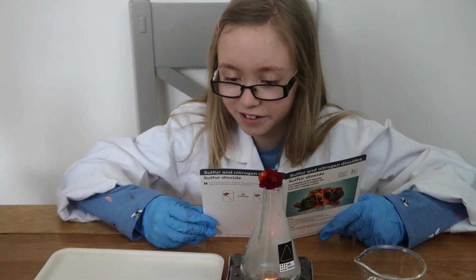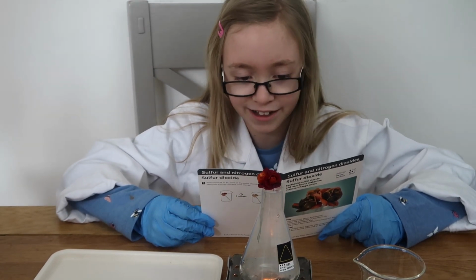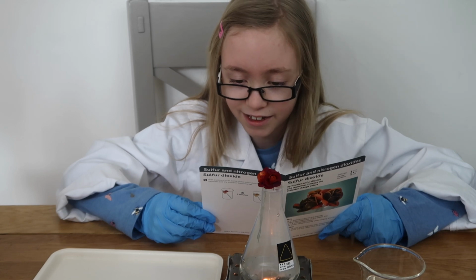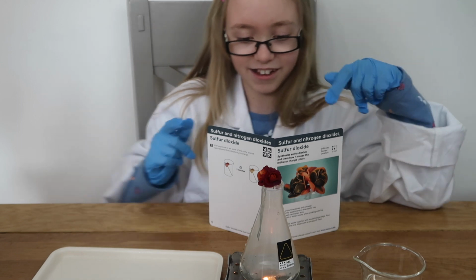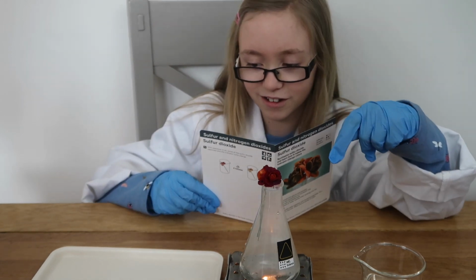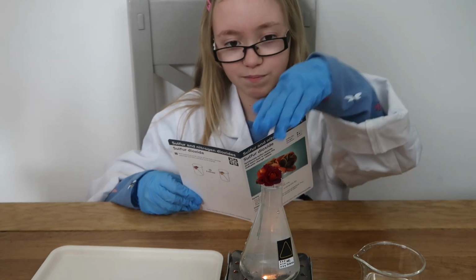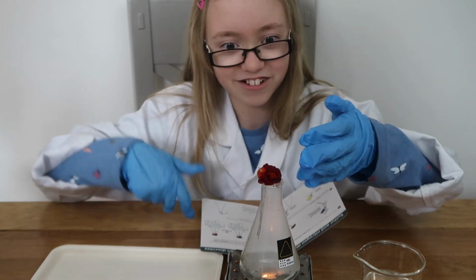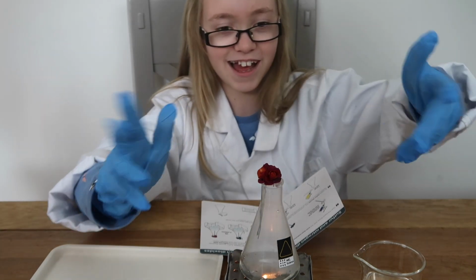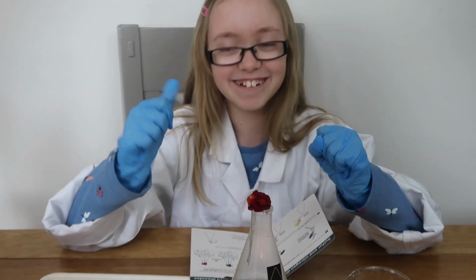It says that the reaction speeds up when heated. Sulfur dioxide dissolves in the water imbued in the flower, forming sulfurous acid. The acid-base indicator reacts to this and changes colours. So what we're seeing happening is the sulfur dioxide dissolves at the bottom, and the water is imbued into the flower by bringing it up. As you can see, it's steaming up a little bit. And that makes it change colours because it's a chemical reaction, making this tiny flower turn red.